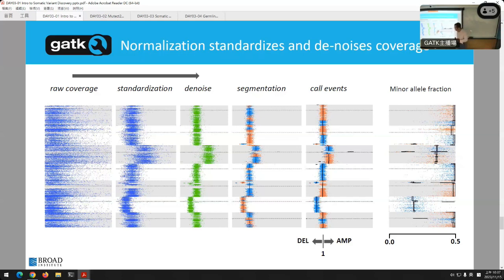And it's plotted here on the y-axis by its position in the genome. So chromosome 1, and this is chromosome X here. And here, the further out to the right, the higher the depth. Look how inconsistent it is there. If you only got to look at this left plot, where are the copy numbers? It's very hard to tell. So what we do is a lot of math and stats to normalize the coverage and pull them out. And we'll teach it to you all this afternoon.